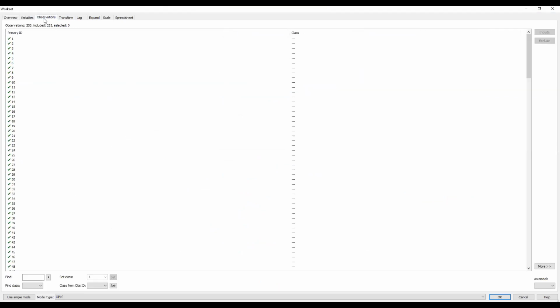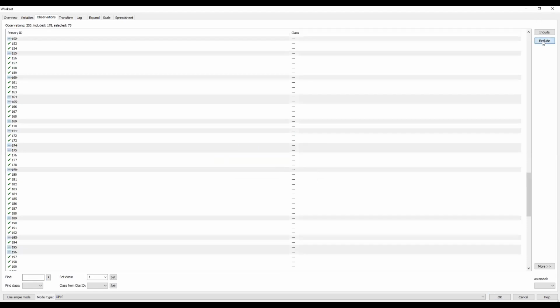In this case, I want to remove a few samples from the data set, and then I'm going to predict them back into the model. And then we see where they sit. This is not the ideal, but it's just a way of also assessing if your model is working. So we select, and then we do a random selection of 30% of the samples that we are going to exclude. And then you say, okay.